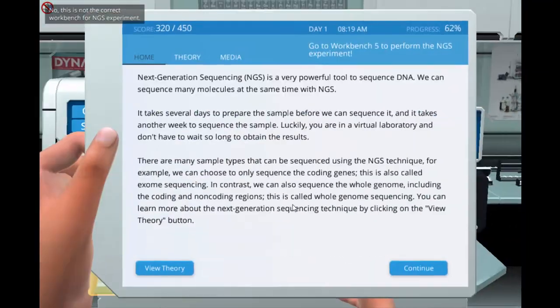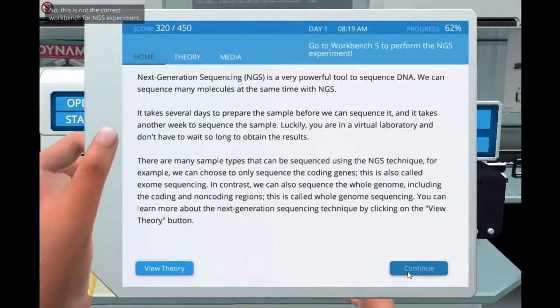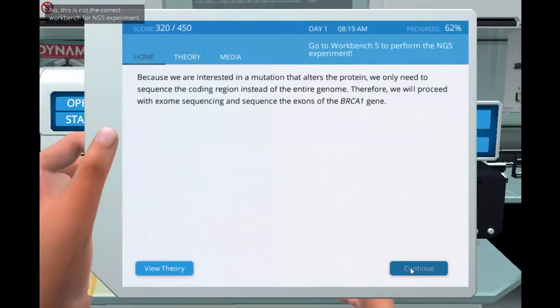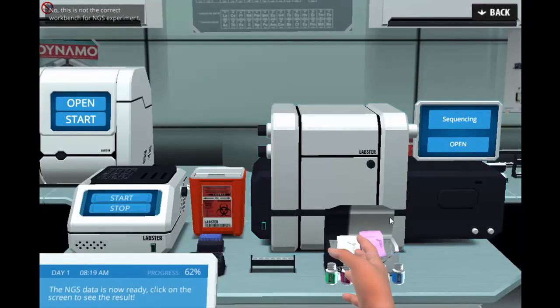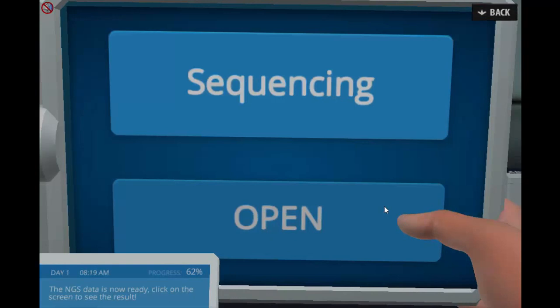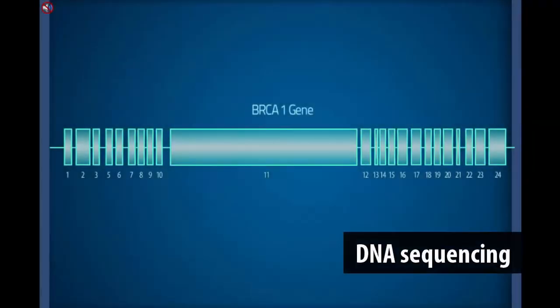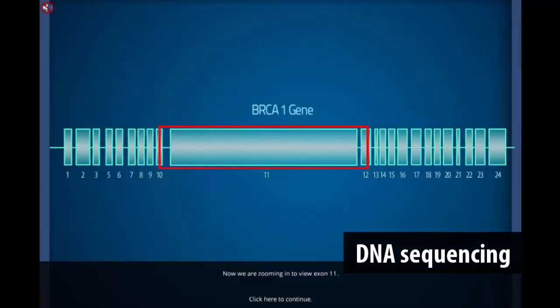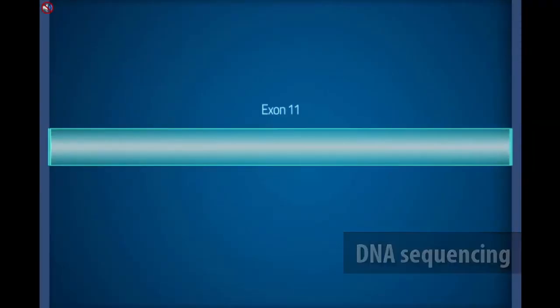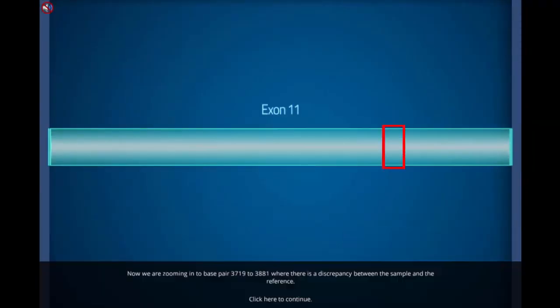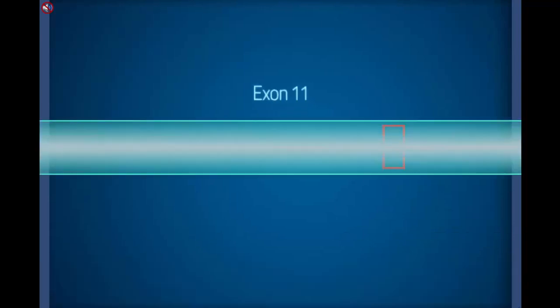Students need to perform a validation experiment to find out the exact mutation causing the truncated protein. They will perform DNA sequencing of this specific gene and analyze the result.